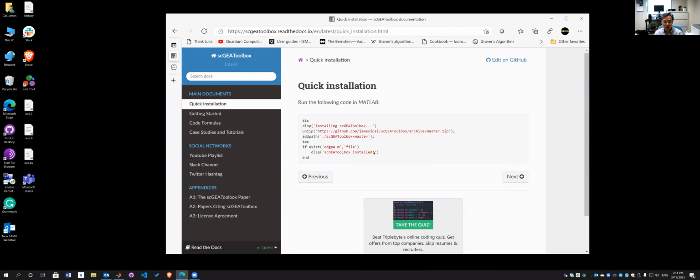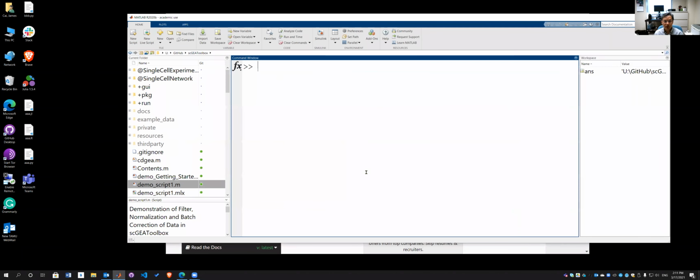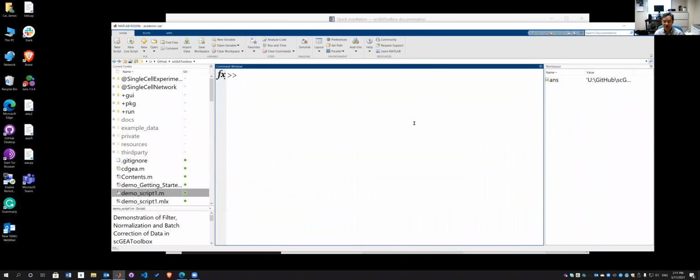And then if you are ready, we can just start to use the MATLAB environment to do this. Yeah, I think we installed that toolbox last week, so I think we'll be ready to go. That's good. So we are on the same page. That's great.